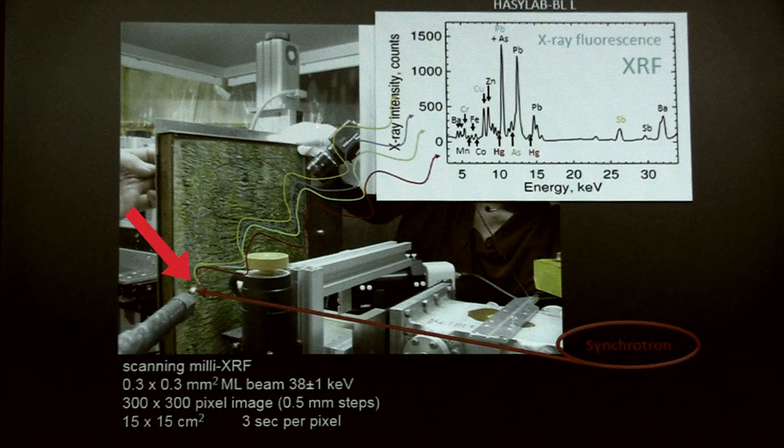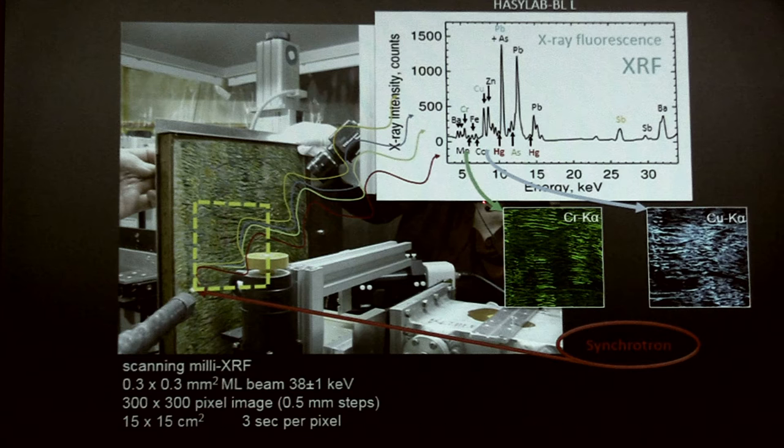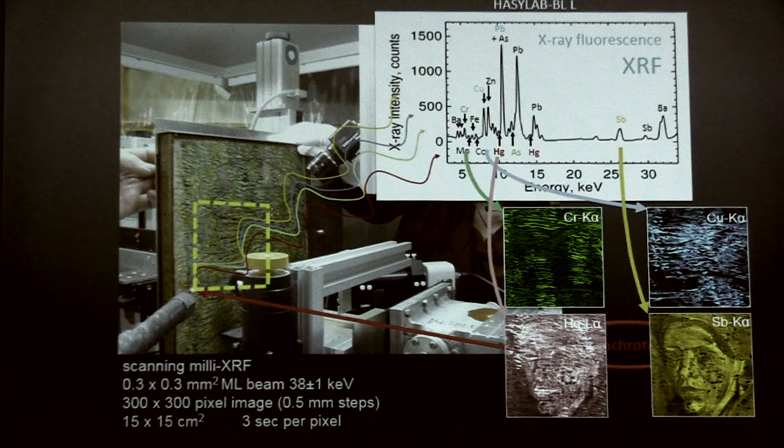So we do this from one point and then we go to the next and we do the same, and we do this, let's say, a million times. We go on many, many points and collect all this information. And then we can translate this into images. We can figure out how much chromium we see on this position and the next one and the next one, and we can produce a chromium map, a chromium distribution image. And this is not very interesting. You see here where Van Gogh used green brush strokes on the surface. Okay? We don't need a complicated experiment to get these maps. We can just look at that or take a picture with a normal camera. So that's not really extra information.